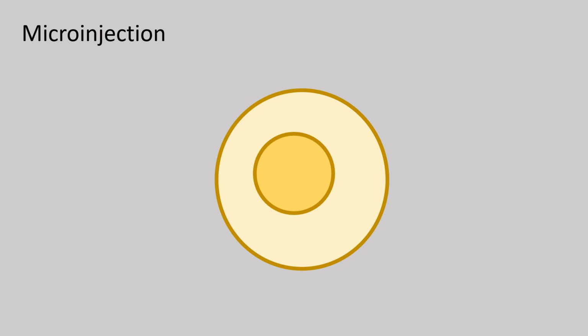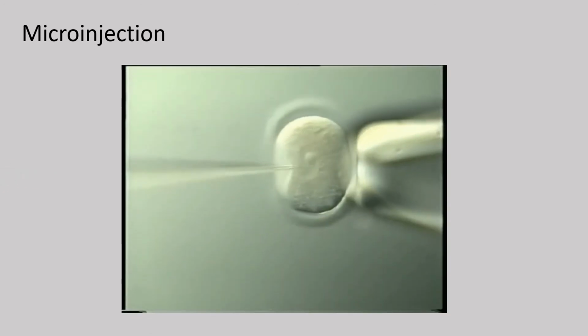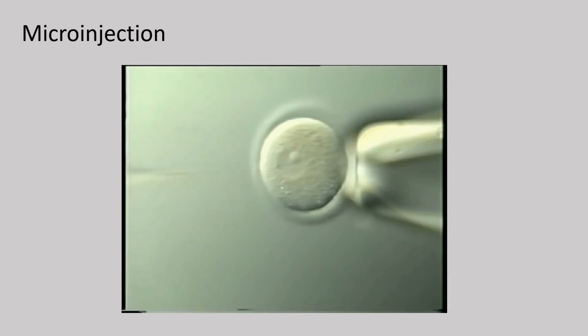The microinjection technique uses a microscopic needle loaded with a suspension of the DNA construct to inject it directly into the cell nucleus. This technique requires a lot of dexterity, as manipulating microscopic tools is a very meticulous task.